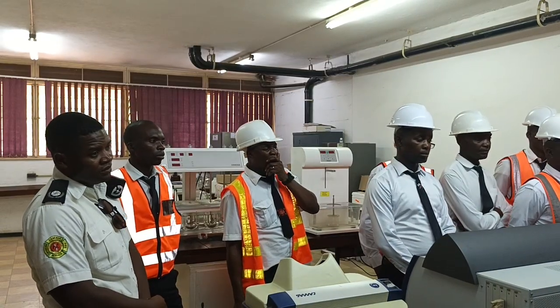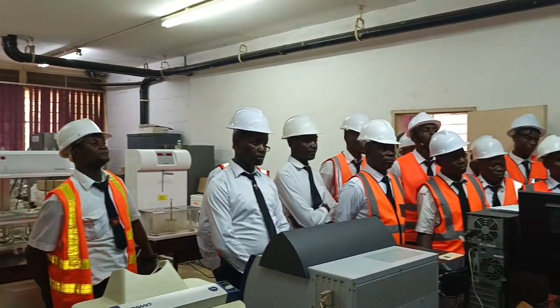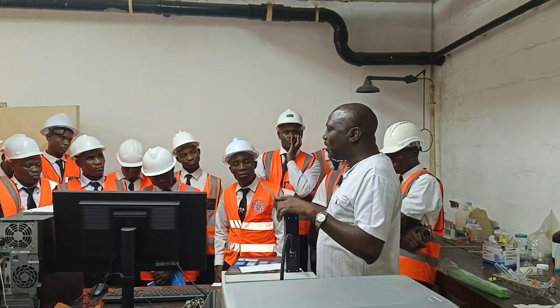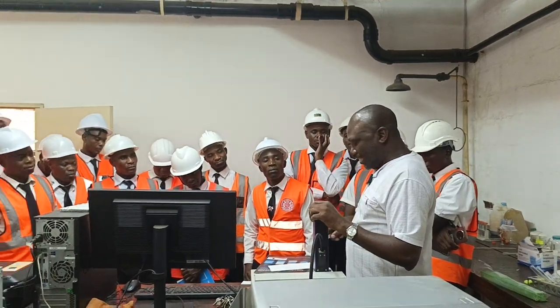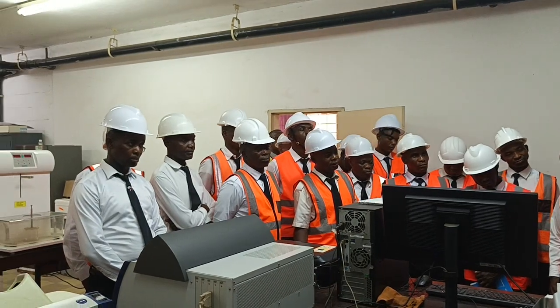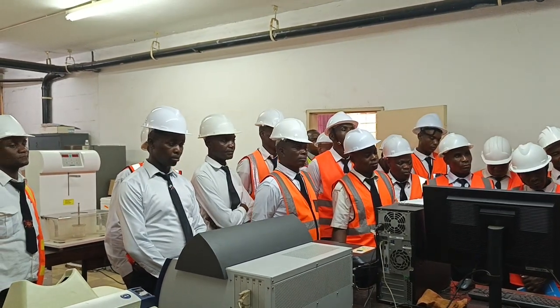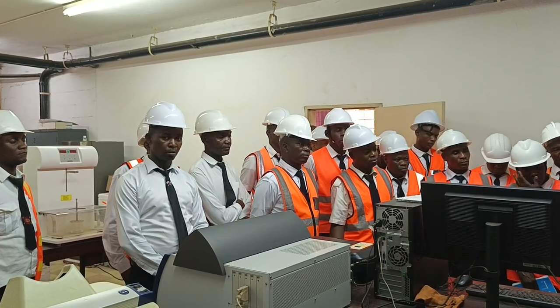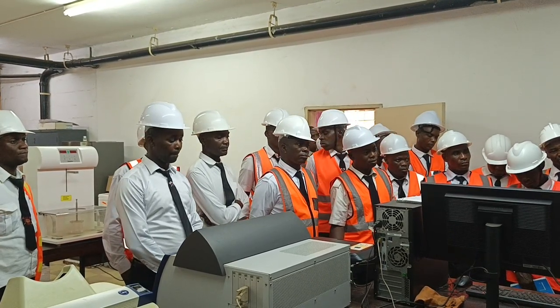We will look at the method. Maybe some methods may take even a week. We're just separating this. Once you are ready to analyze it on here, it takes even less than an hour or so. I should have the results on the machine. But what can take longer is how am I going to prepare my sample?